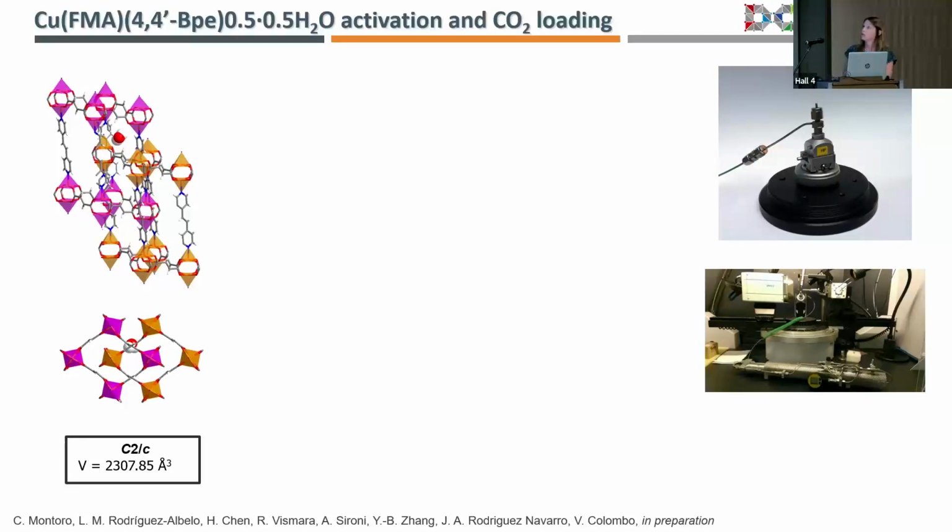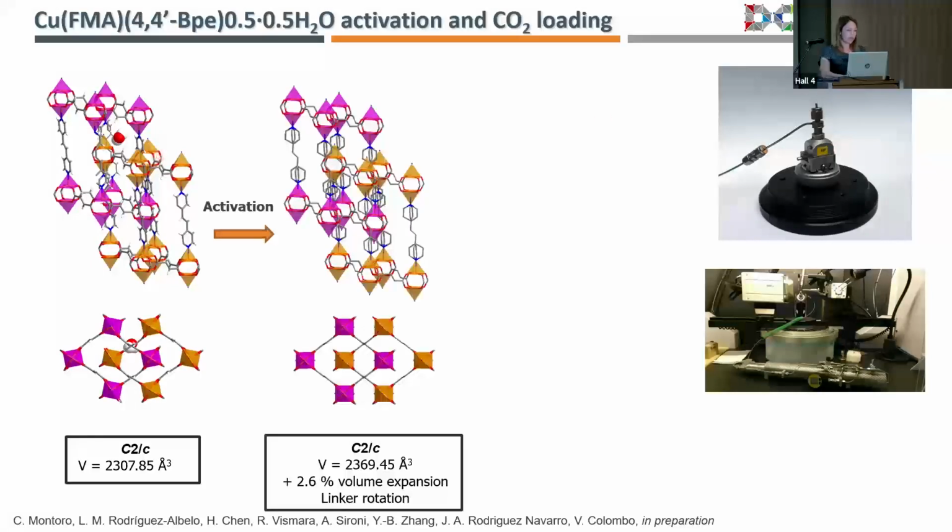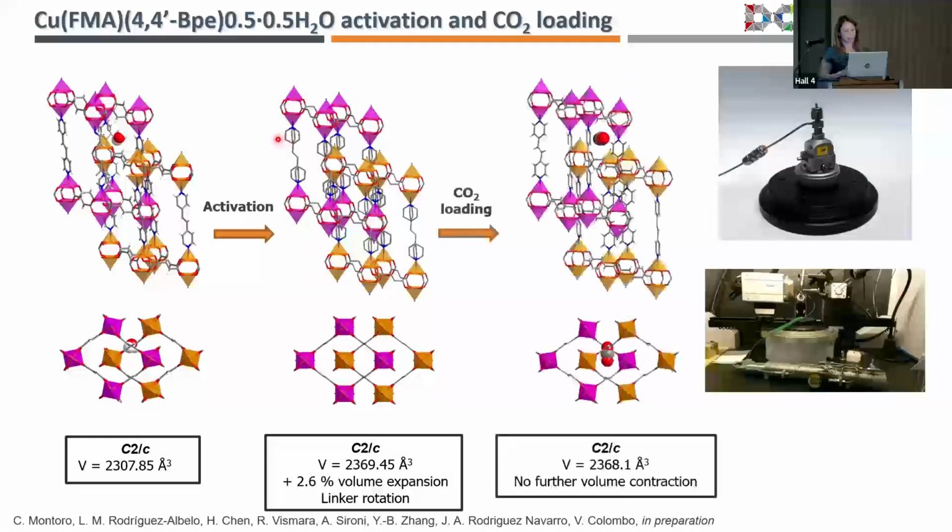So we grew the single crystal of this MOF. We solved the structure of the synthesized phase. And we have seen that in this phase, there is a water molecule inside the channels. And this is actually the solvent in which the MOF is produced. So after activation, there is a small volume change, and only the rotation of the pillars of this MOF, which are disordered over 3 positions. So a simple in situ experiment in which we just activated the sample.